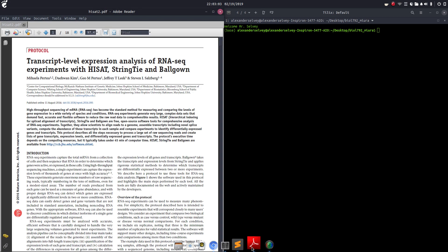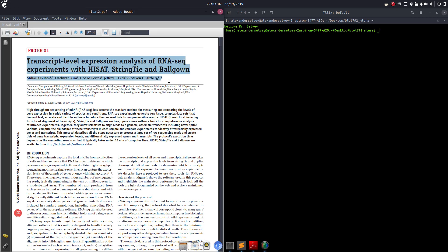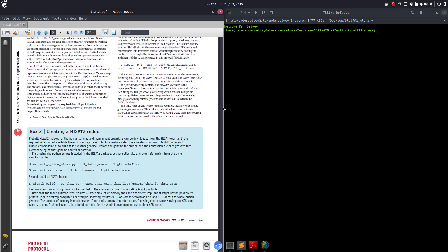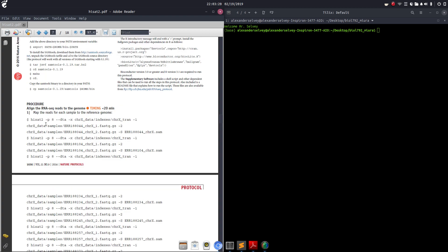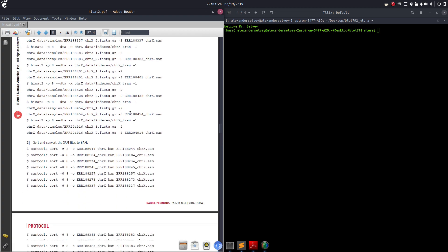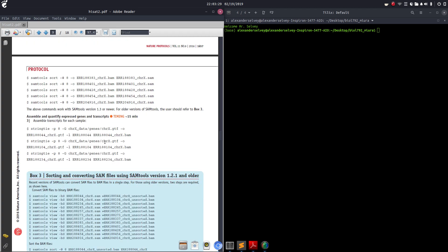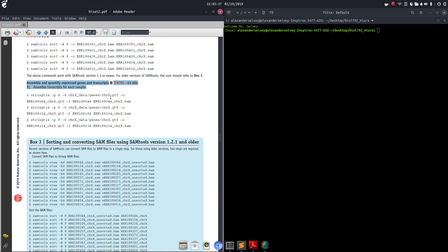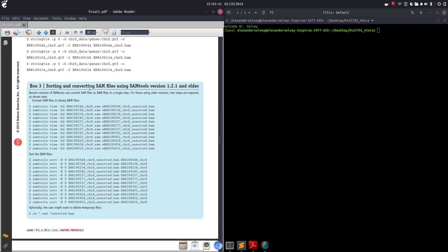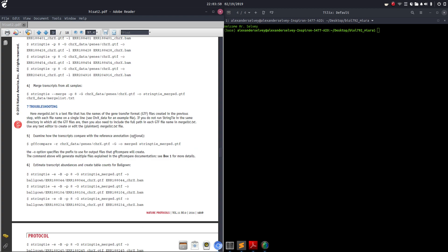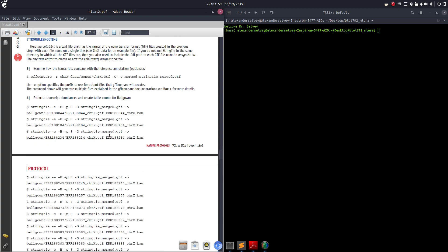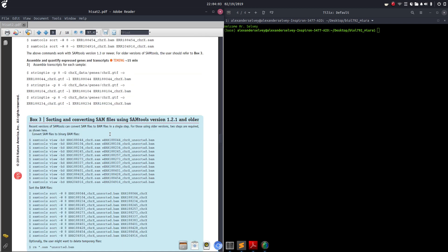Last time I failed to mention, but this is the paper that we are using, and here is the protocol as well as all the code that we've run so far. We ran HiSat - it maps the reads of each sample to the reference genome, sorts and converts SAM files to BAM. We are going to be starting on step 3 using StringTie to assemble and quantify expressed genes and transcripts. We'll be assembling the transcripts, merging all transcripts from all samples, examining how the transcripts compare with the reference annotation, and then we'll estimate transcript abundance and create table counts for Ballgown.